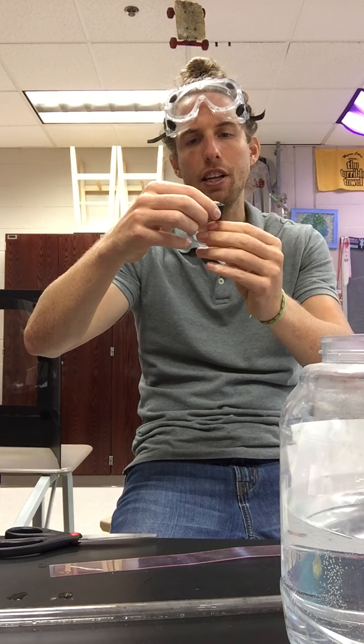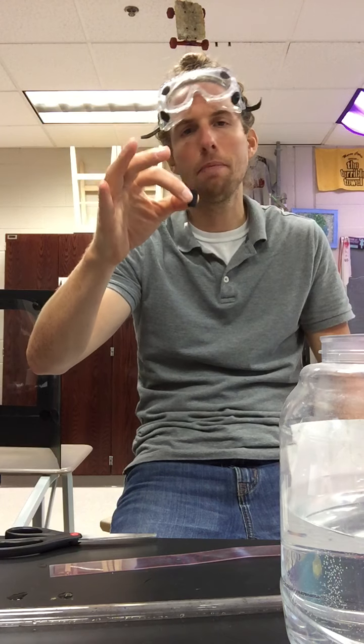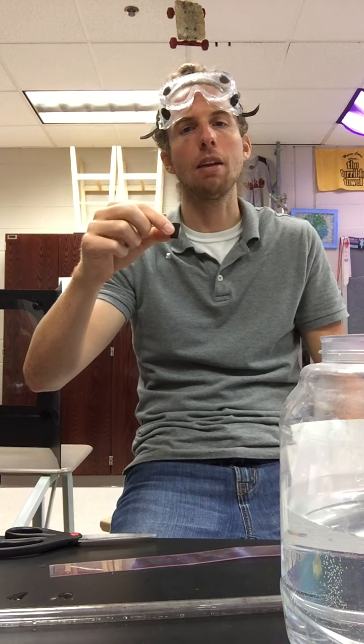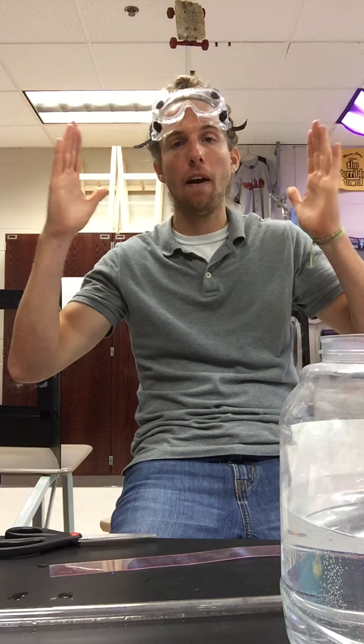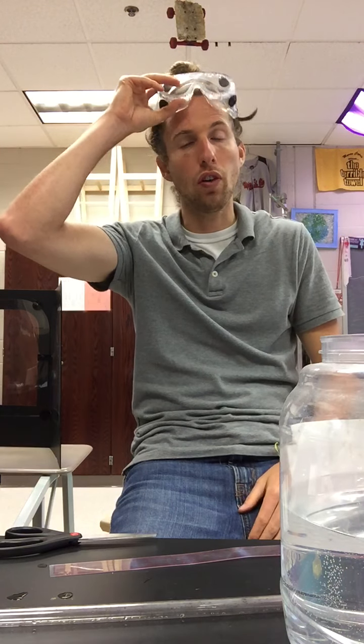The other thing that I need to tell you data-wise is the length of this piece of magnesium. So this piece of magnesium that I've strung up on this little piece of copper is 1.41 centimeters long. And in order to get a mass for that piece of magnesium, let me tell you the mass of an entire meter of magnesium. If I had an entire meter of magnesium, it would weigh 2.04 grams. 2.04 grams for a single meter. If I have a piece that's only 1.41 centimeters, you guys can figure out the mass of that piece.